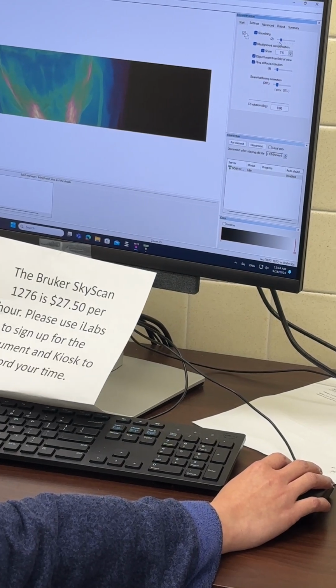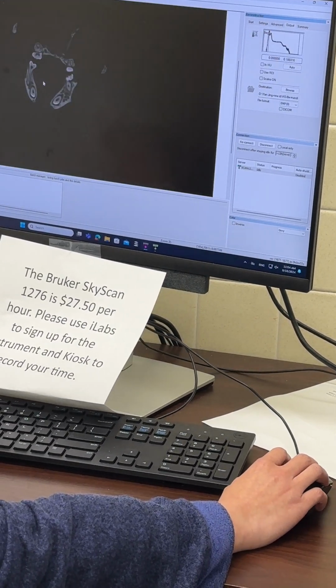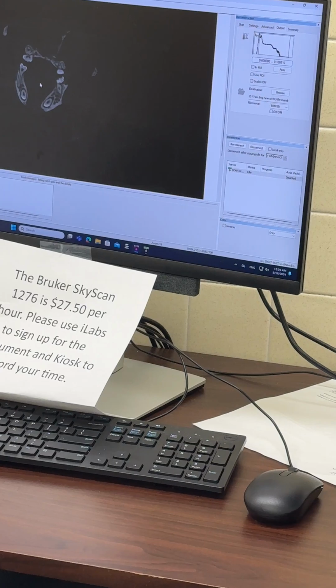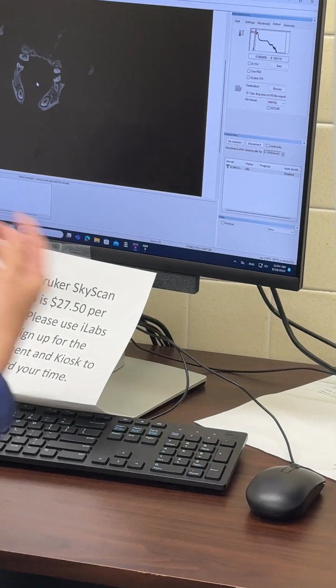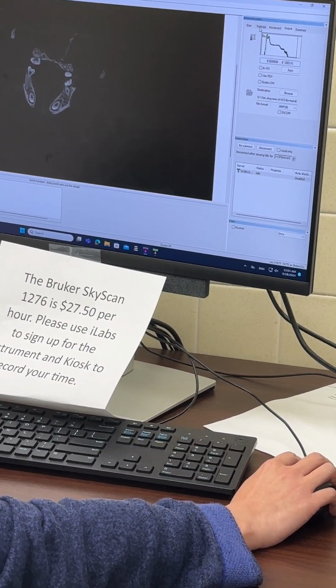What we need to do is adjust those parameters to make sure our CT image is not blurry, very clear, and also comparable. That's to say you can see the difference, like the newly formed bone or whatever defect, between this group and the other control group. So this is the basic principle of how to set it.